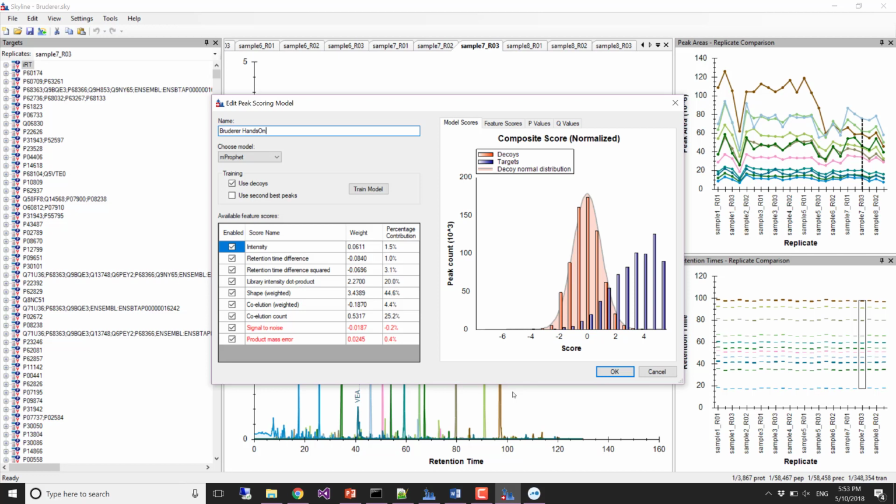Yeah, I'm sorry. I don't think it matters much, especially when we're down at like point something percent. It's just like, this is not a meaningful score. I don't quite know what direction to put it in. So, I don't think it would matter at all. You could uncheck it and then retrain the model for sure if you wanted to. But it's not really a big issue here.